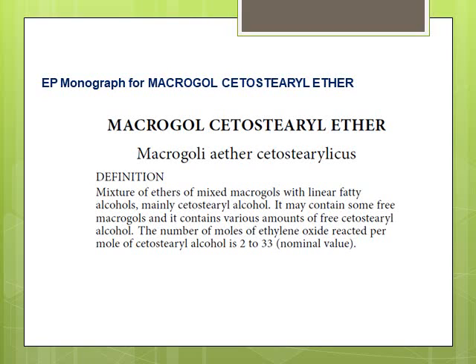And the PEG or macrogol could be PEG 2 up to PEG 33. So this monograph covers a wide range of different Ceteth or ceteareth 20 type excipients.